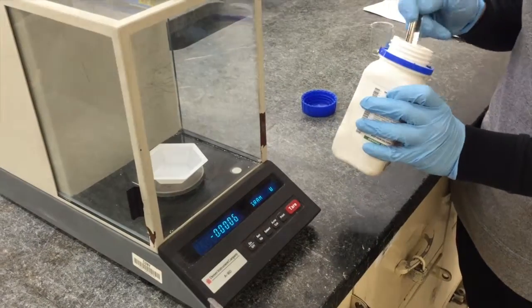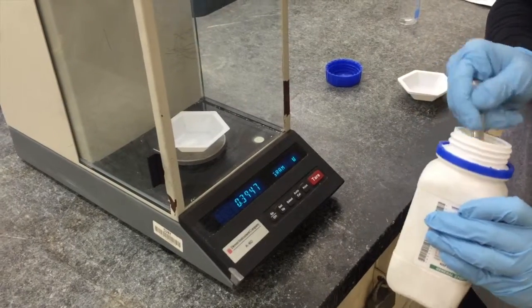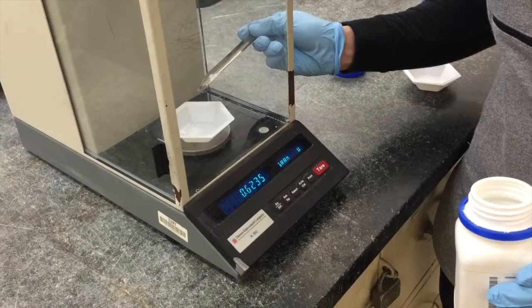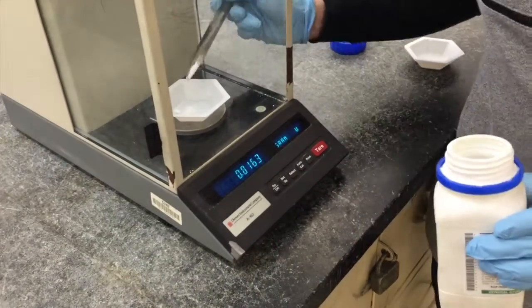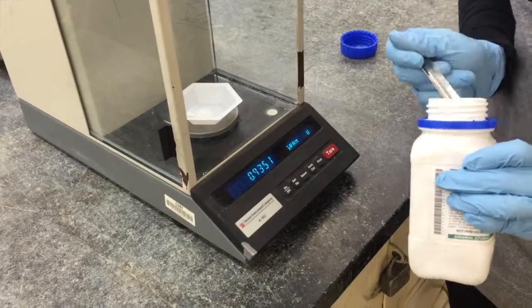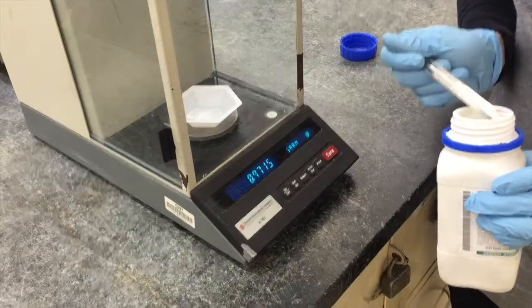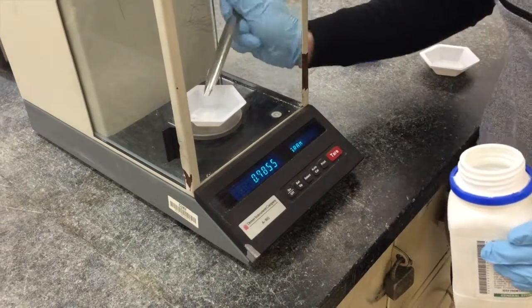Once the device has been zeroed, we can begin transferring our compound to the scale. For the purposes of this video, let's say we want to measure one gram of our compound. Begin by slowly transferring your compound in small increments to the weighing boat, decreasing the size of these increments as you get closer to your one gram final target mass.